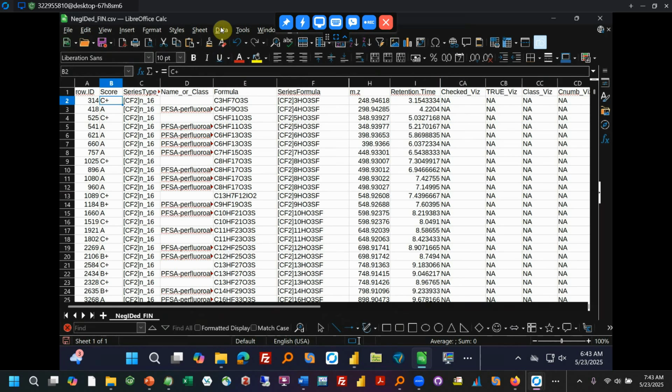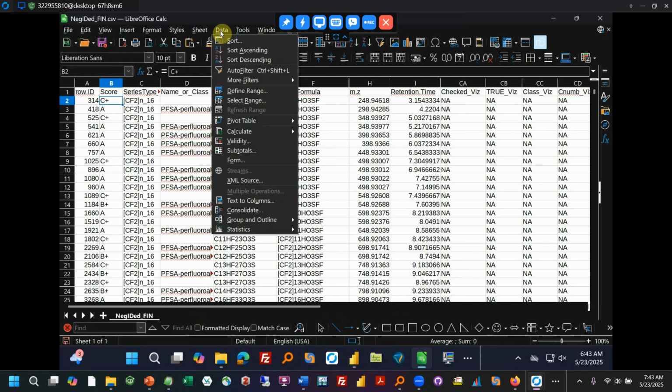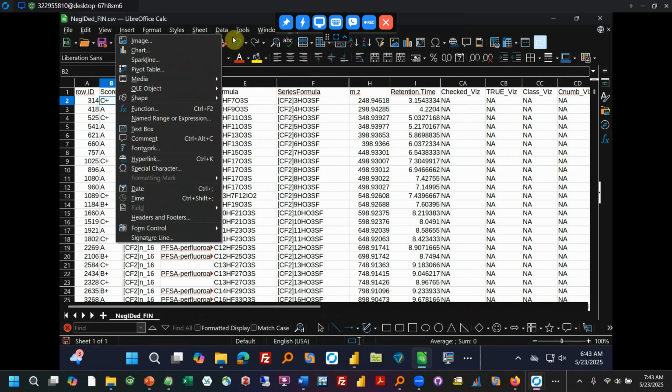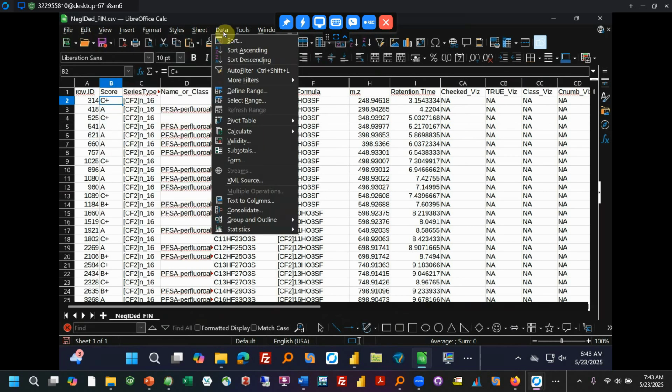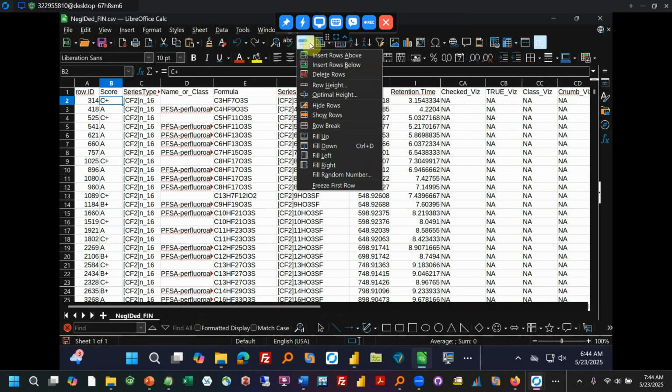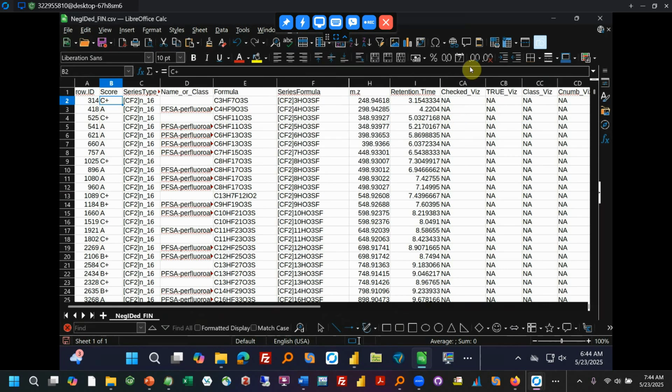So, I believe. Oh, here we go. More used to Excel. All right, so it's freeze pane. So now you can scroll down.